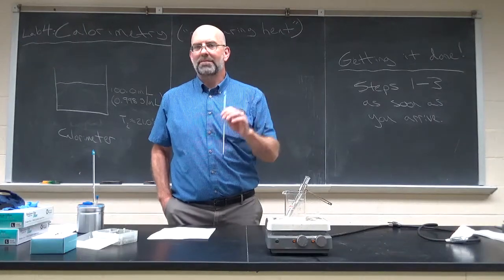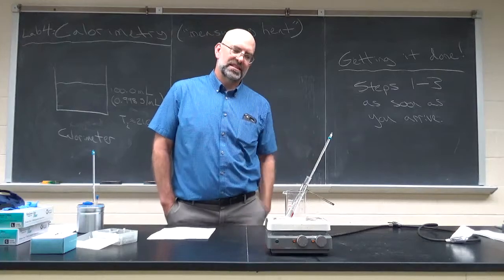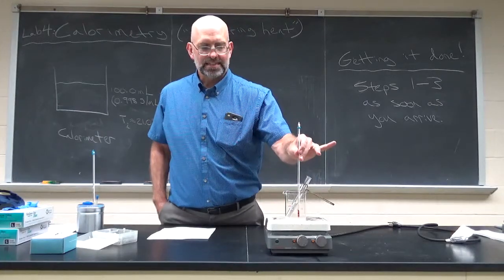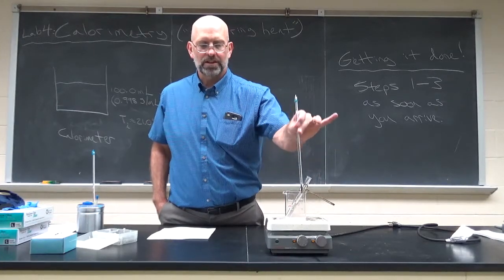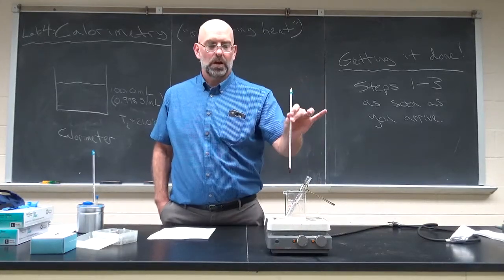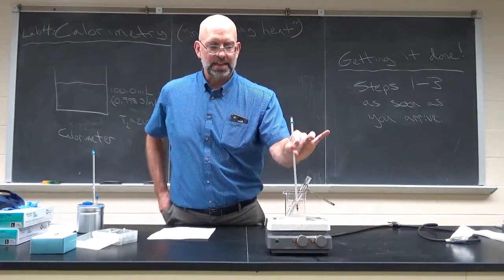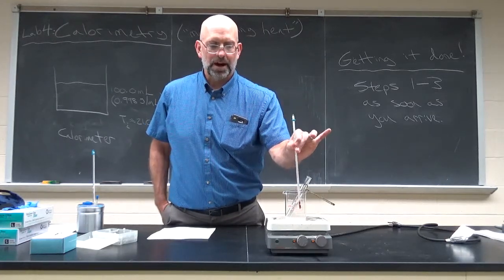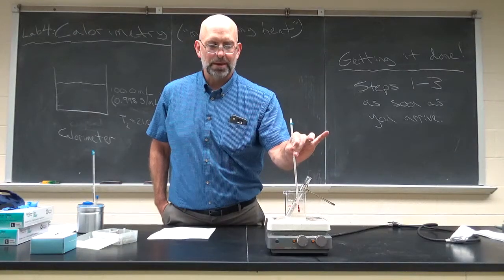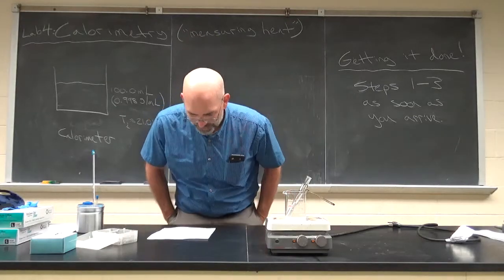And eventually you'll measure the temperature. I want to point out how to measure temperature. What you don't do with temperature is drop the thermometer and let it sit. Because now it's touching the bottom, and it's probably too high of a temperature based on this hot plate. So you want the bulb suspended in the liquid, so that it's not touching the bottom or the sides, so it's only recording the temperature of the boiling water. I'll get to where we use that later. Okay, and that goes for 15 minutes.